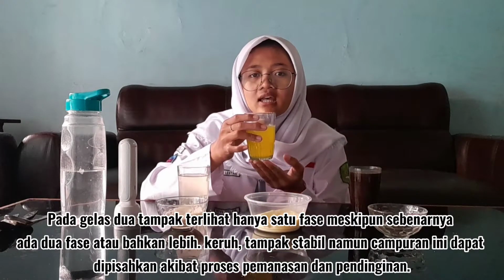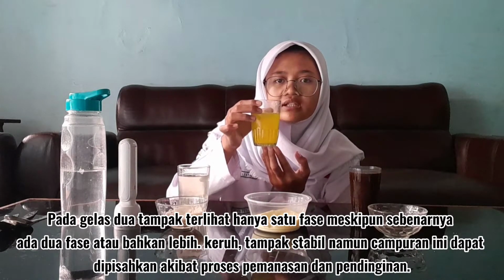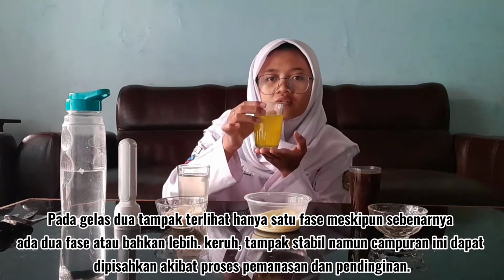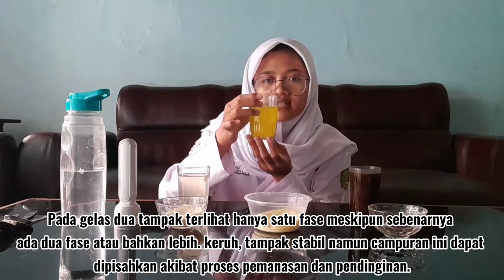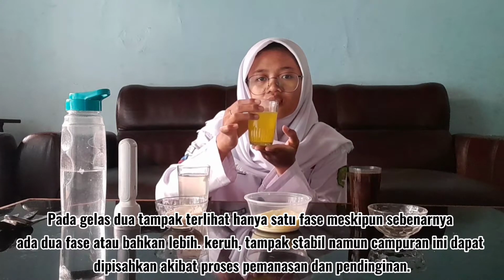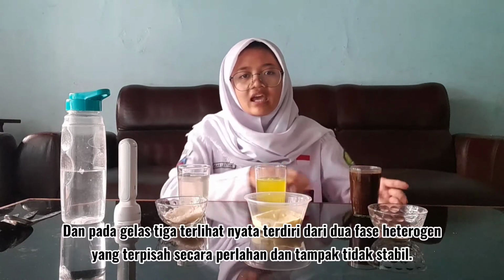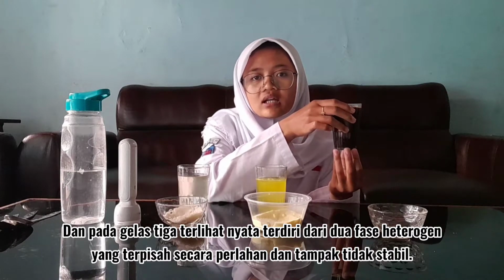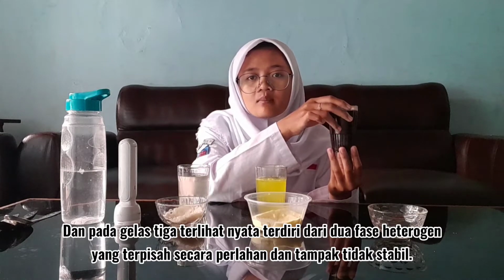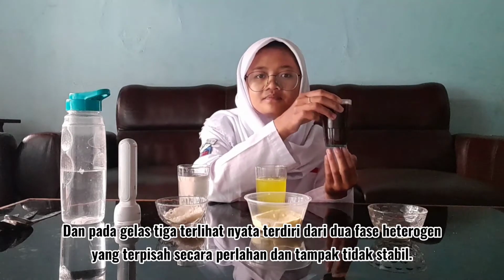In the second glass, there is only one phase, even though there are actually two or more phases, but the turbidity looks stable, and this mixture cannot be separated easily except by heating and cooling processes. And in the third glass, it appears to consist of two heterogeneous phases that separate slowly and appear unstable.